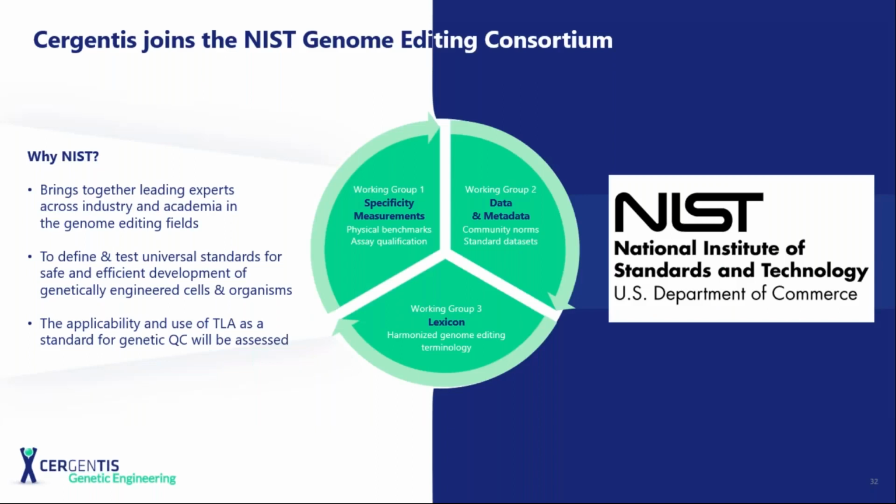Recently, we joined the National Institute of Standards and Technology from the US Department of Commerce, which is a body that characterizes genome editing tools and quality measures, and they will evaluate and determine whether TLA is a genetic quality control tool that can be used by the different research labs and companies working in genome editing in general.